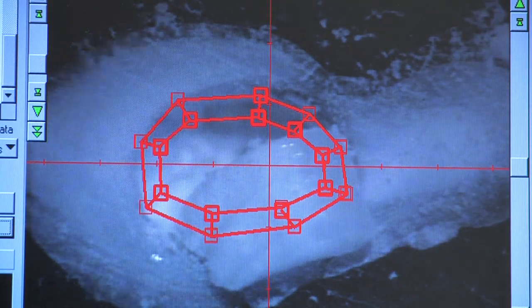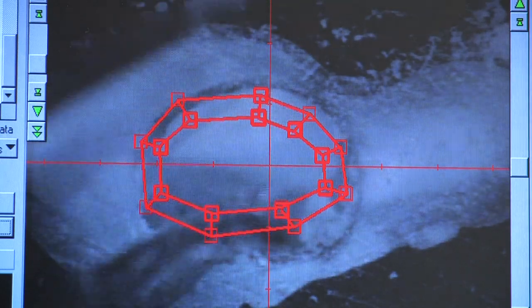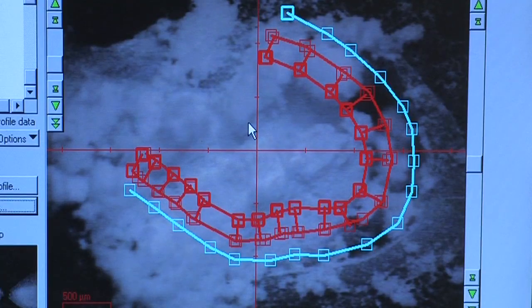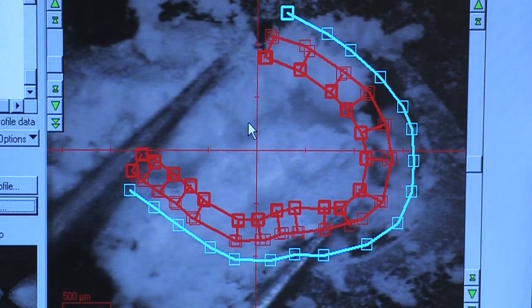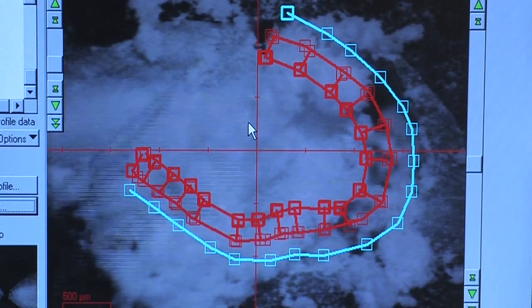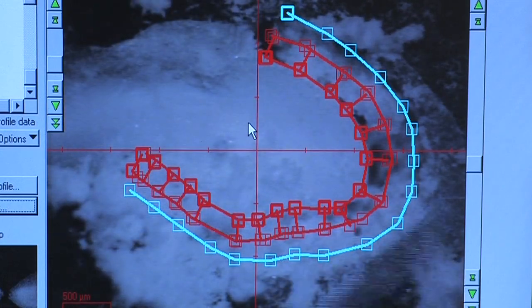Once the Micromill is set up, you can basically extract two varieties of samples, actual cores or pieces of your sample, or for smaller otoliths, powder. This will also depend on what type of analysis you are doing to your samples, as it will require different amounts of sample material.